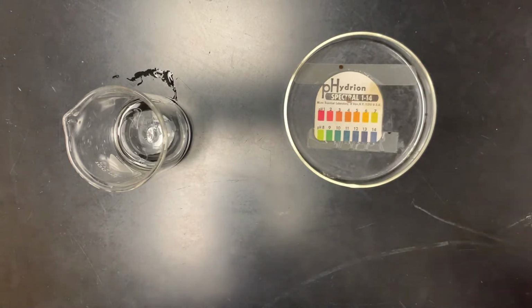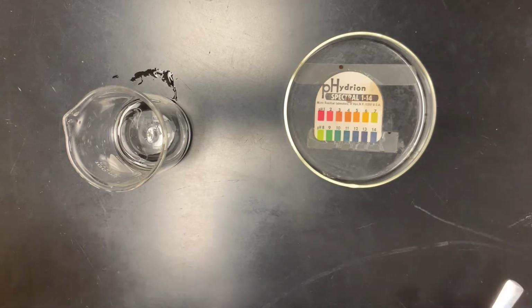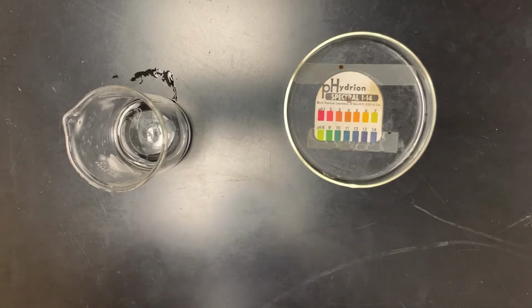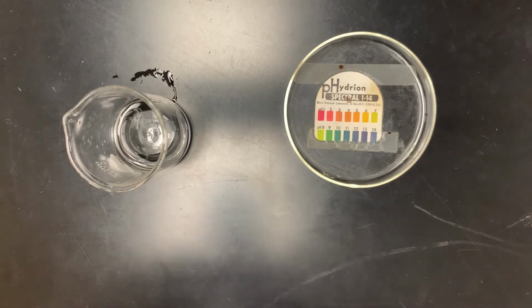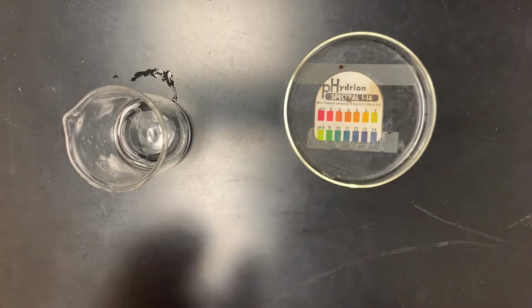The reason behind that is because carbon dioxide gas readily dissolves in water, creating carbonic acid. So we're actually going to see that it's slightly acidic. So all these solutions will have to be evaluated with that in mind. So really what we're doing is using that pH of water, we'll call it 5.8, as a baseline, right? And we'll see how these solutions deviate and become acidic or perhaps basic in nature, okay?